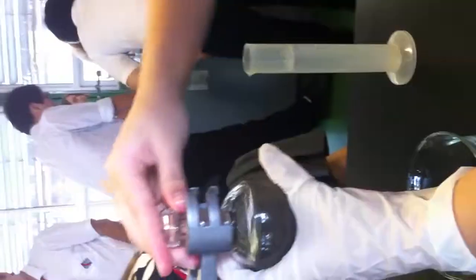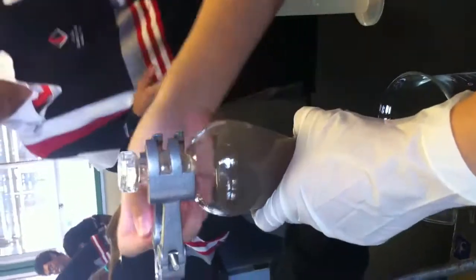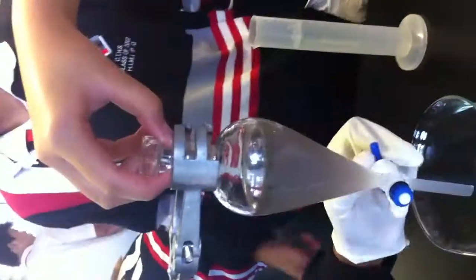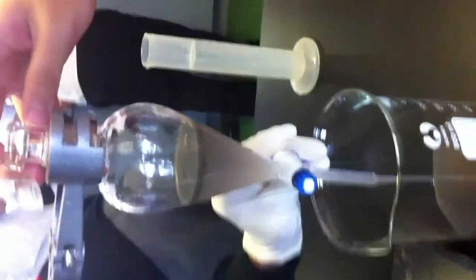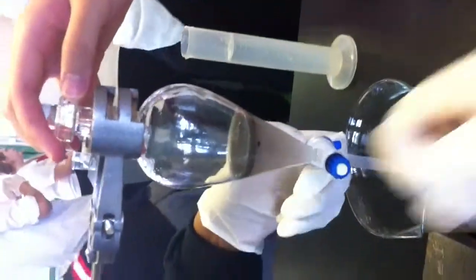How about you try this? Well, let some air into it so it has... What do you want to do? Yeah, that's what I said. Let some air into it. Careful, someone hold it. It's gonna drop. This is also black. It's supposed to be orange. Can I just open it when it's closer to the end? But the teacher said that it's not ruined, it's just a different color, it does the exact same thing. Yeah. Oh, do we go up to that line? Yeah. That's the line we do it to.